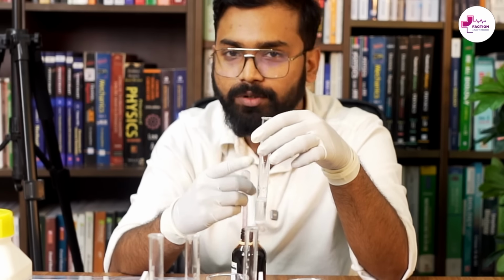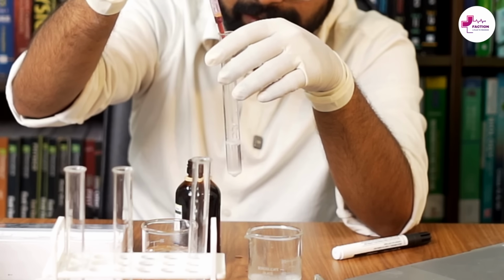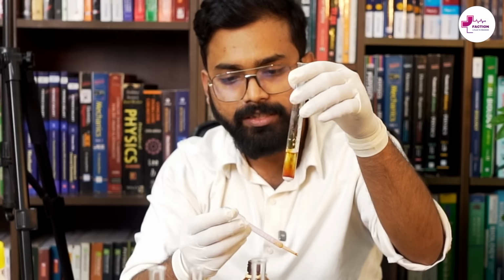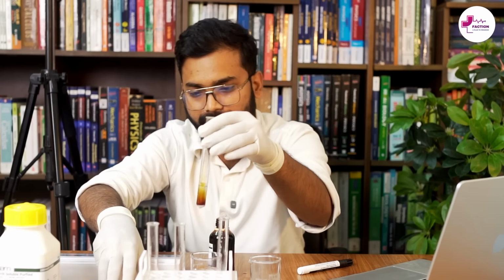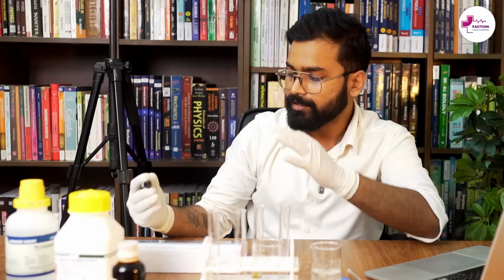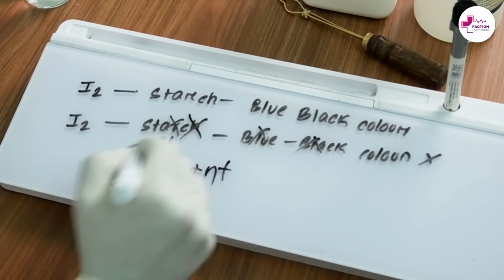According to our theory, starch should have been digested. So now I am putting drops of iodine right here. And according to our theory, the iodine here should not turn blue black since the starch is absent. Let me repeat this theoretical part. As I said, our theory said if amylase is present, then starch will be absent. There will be no blue black color.